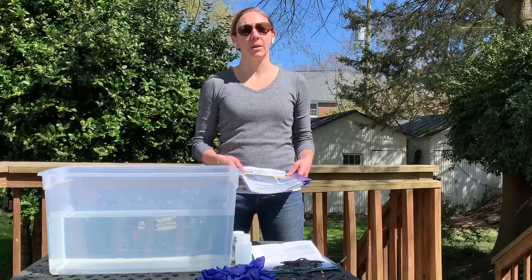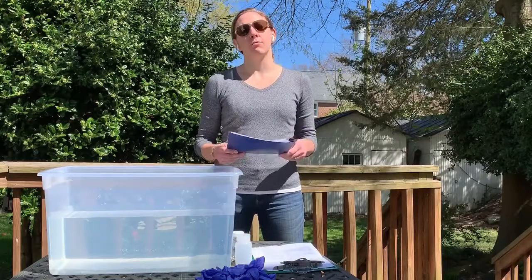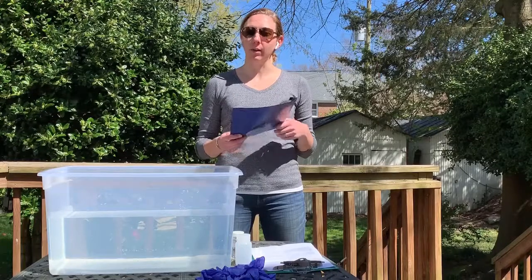Hey guys, I'm Liz and I'm going to be showing you how to collect your water quality samples for the Potomac Riverkeeper Network Citizen Science Water Quality Monitoring Program.